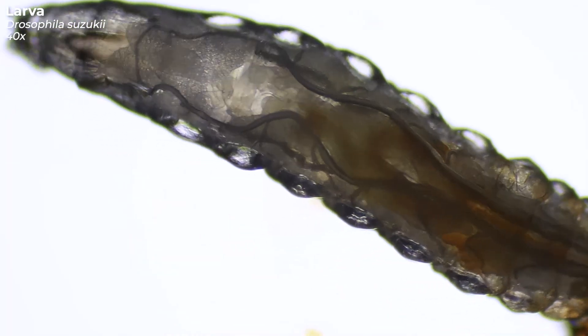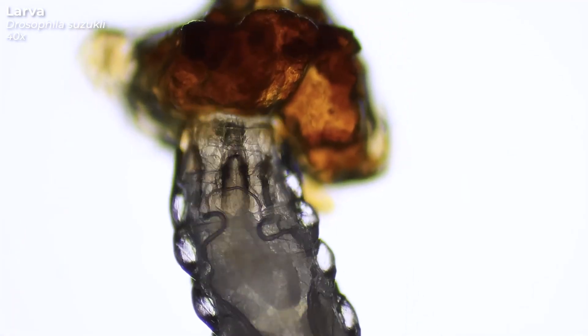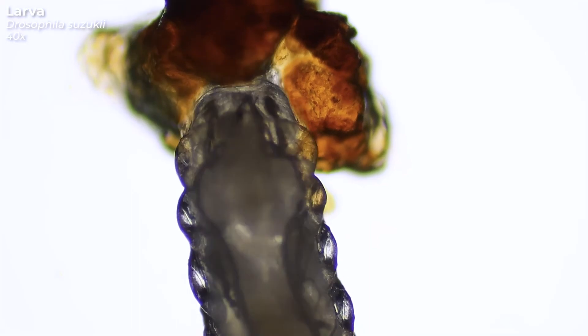Theoretically, we could just eat the larvae along with the plums. They are not dangerous or poisonous for us — they even provide an extra portion of protein. But since I am not Bear Grylls, I prefer my fruit without an extra portion of protein.